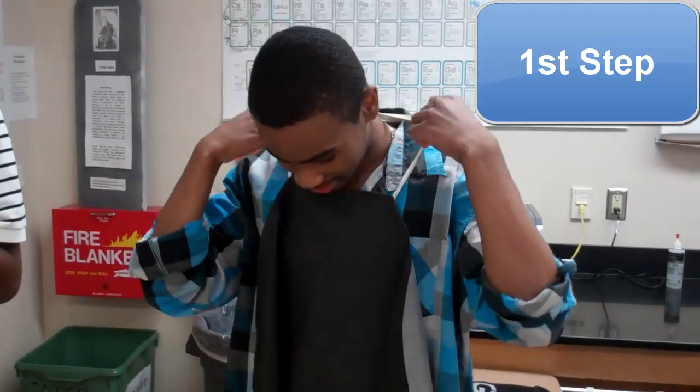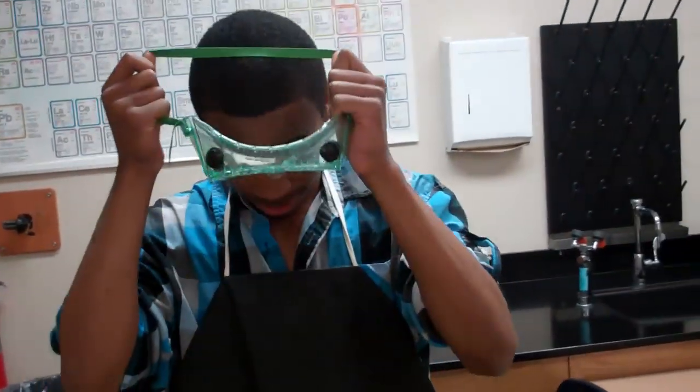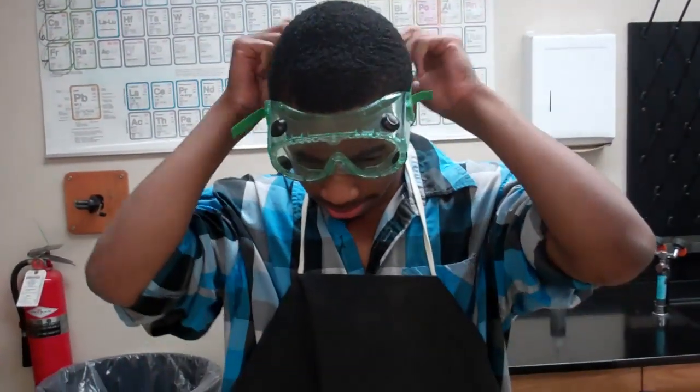First, we need to put on our aprons. Make sure they're tied. Put up all long sleeves, as well as put on your goggles. You want to put the goggles on securely and wear them throughout the whole experiment.